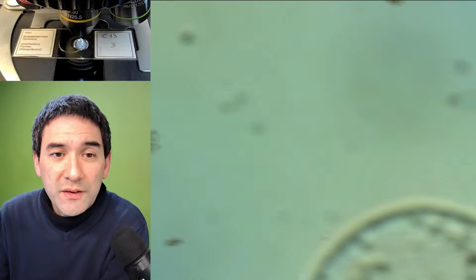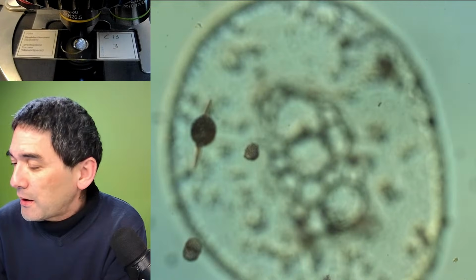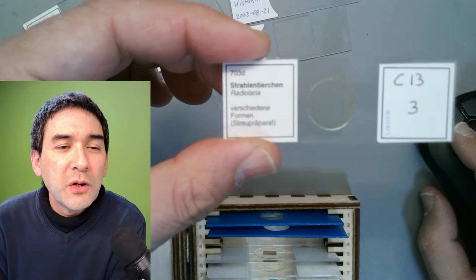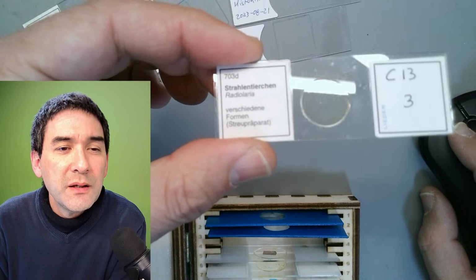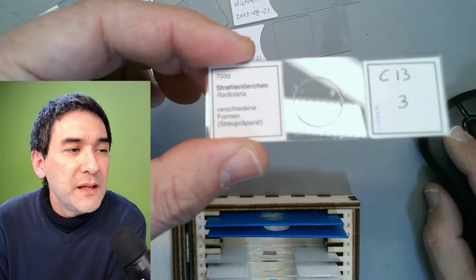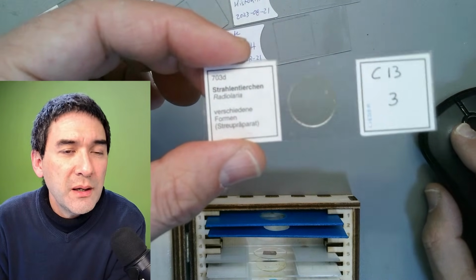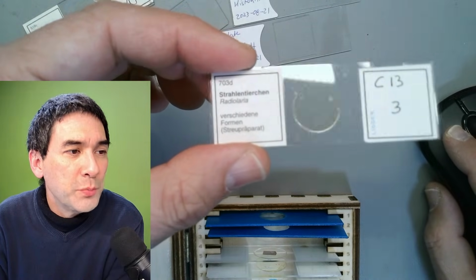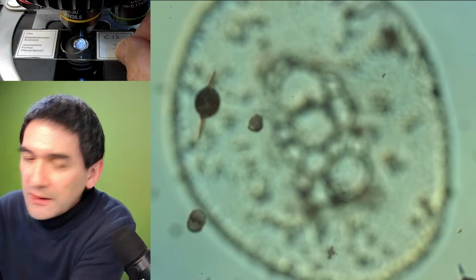So this one over here, that's a nice one as well. Okay, so I'll show you first, always the slide label, so that you see a little bit of what we've got here. These are called Radiolarians. Okay, they have a shell made of silica. So these are the shells of certain microorganisms, and they have a really nice pattern.